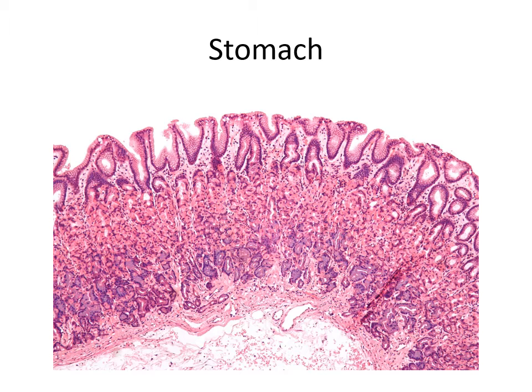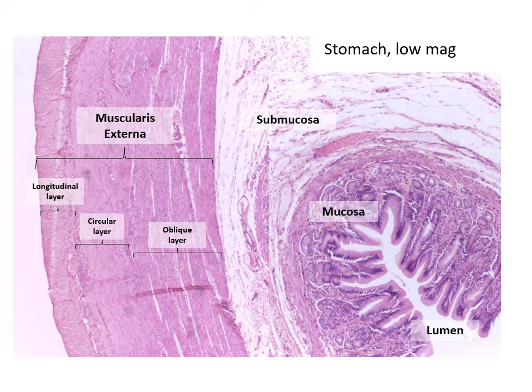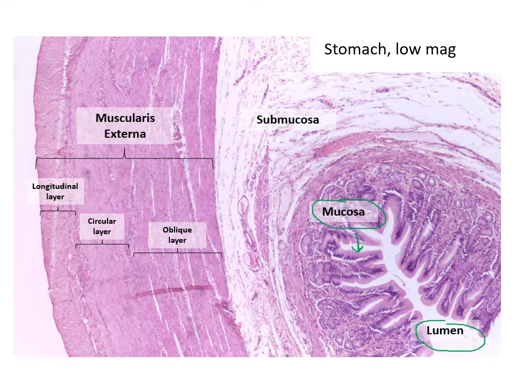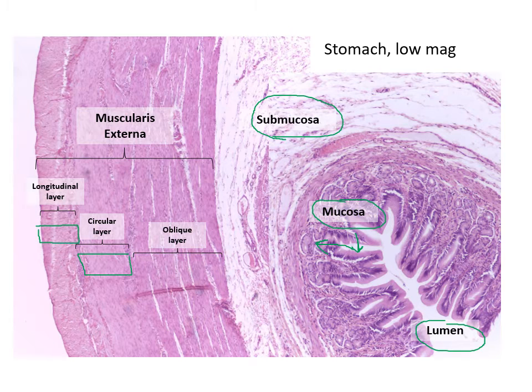Here's another image of the stomach — you can see down in here are these gastric pits. Here's a low magnification view so you can see all of the layers. We've got our lumen here in the middle. Here is our mucosa — our simple columnar epithelium diving down into those gastric pits. Submucosa is the connective tissue deep to the mucosa, and then our muscularis externa. In the stomach we have three layers of smooth muscle: the outer longitudinal layer, the middle circular layer, and then the oblique layer which runs kind of diagonal.